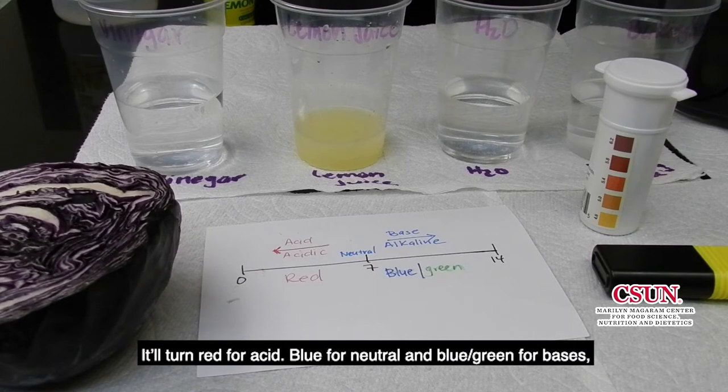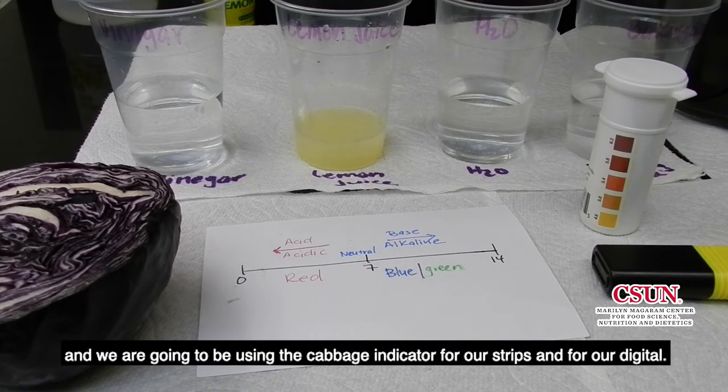It'll turn red for acid, blue for neutral, and blue-green for alkaline. And we are going to be using the cabbage indicator alongside our strips and our digital meter.